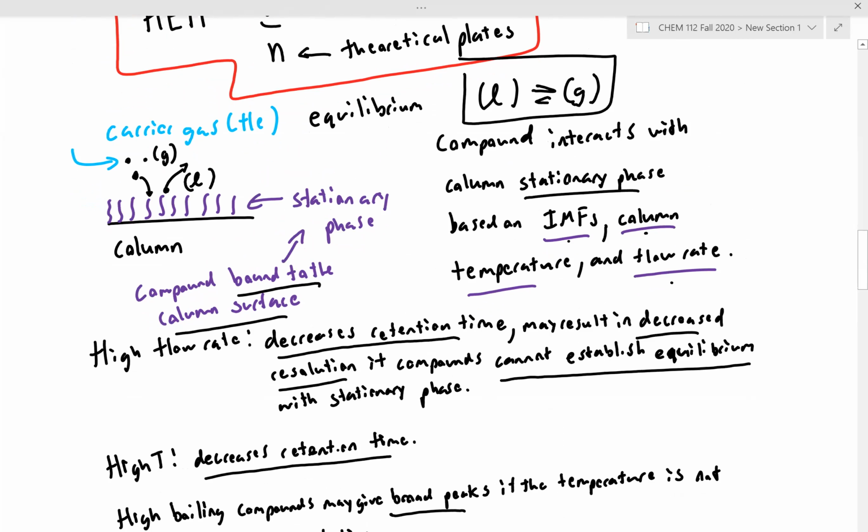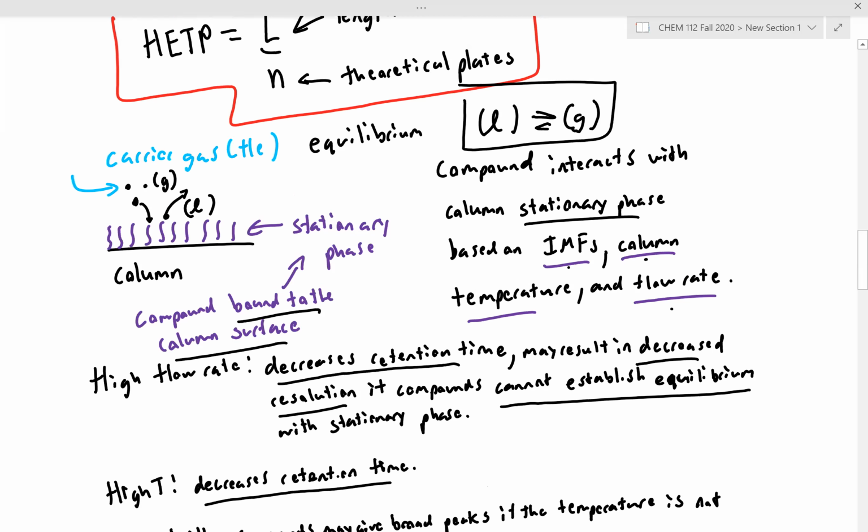So, different compounds pass through the column at different times based on their intermolecular forces. We can control the exact conditions of our column to optimize the separation. We can control the temperature, we can modify the stationary phase, we can control the flow rate. We've already optimized all of these background pieces of information so that the separations you're going to watch in the video run as smoothly as possible. I really can't understate that this optimization does take time. But we've done this optimization, and now we're ready to separate our compounds using preparative gas chromatography.